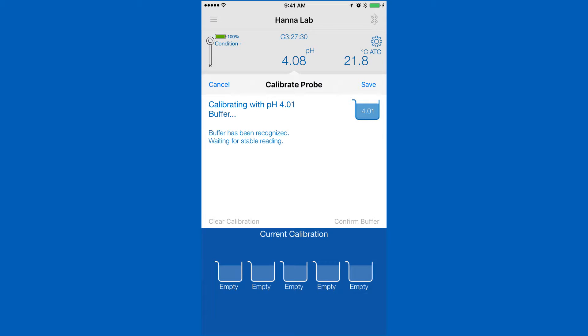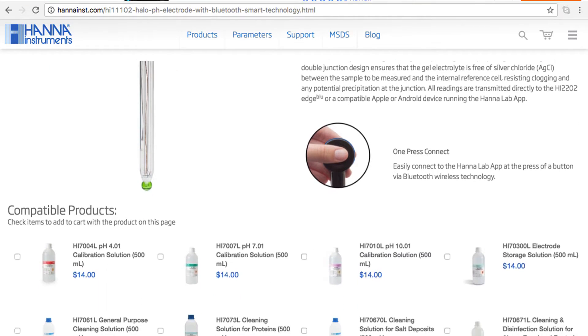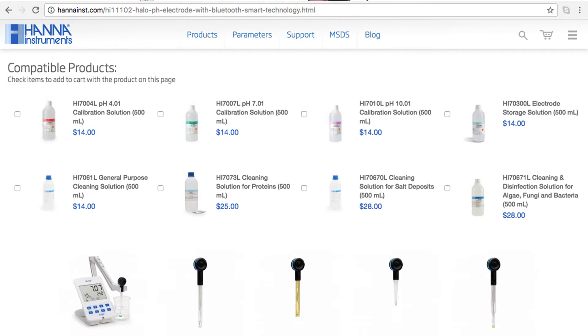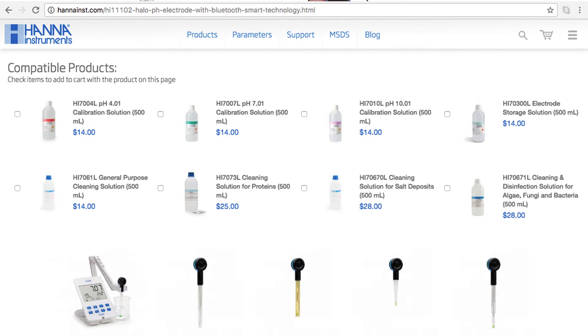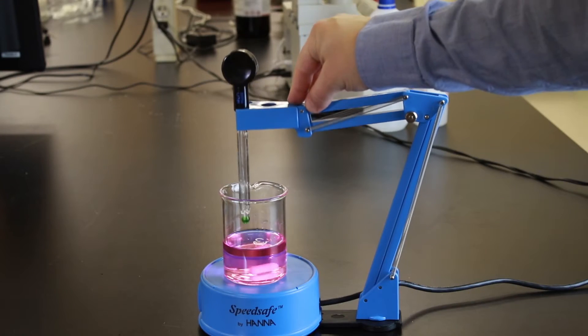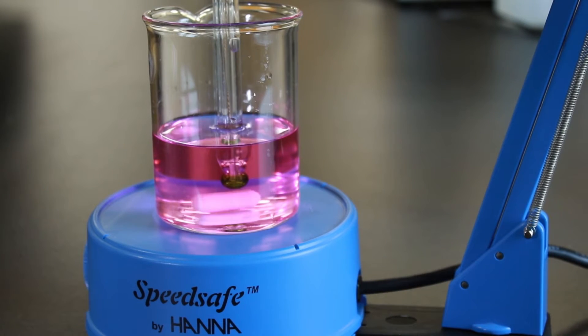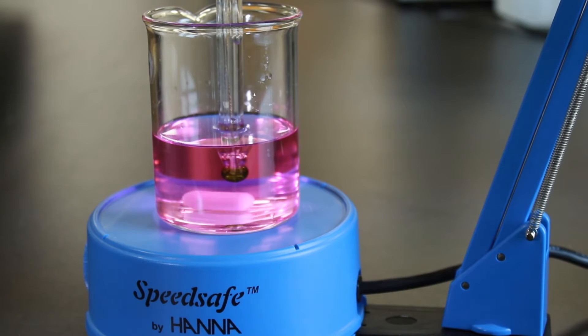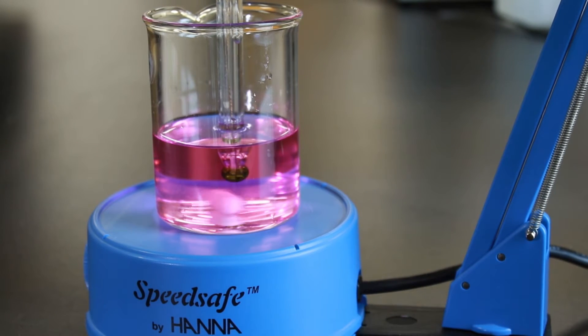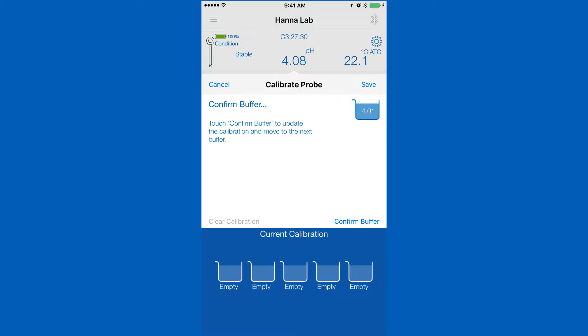Your Halo can calibrate up to 5 points that are automatically recognized. You can find all the calibration solutions you need right on the product page. Rinse and place your probe in your pH calibration solution and wait for a stable reading. Once stable, tap confirm.